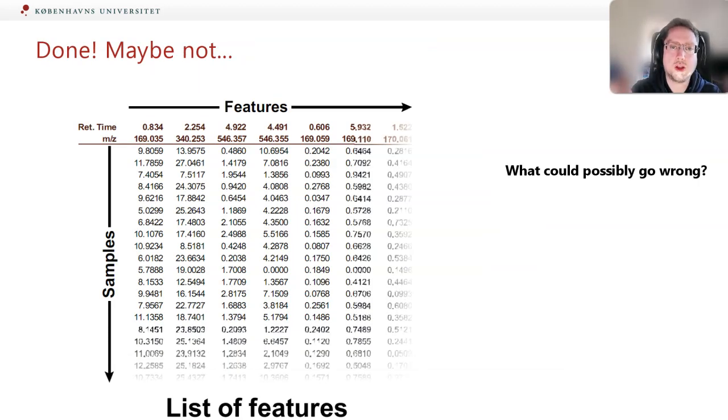So we are done. We now know which peaks are the same in the different samples, so we can construct a peak table like we wanted. Each feature in the columns and a row for each sample. Done. Or perhaps we can do a little bit better.